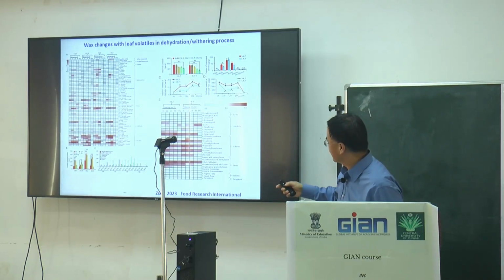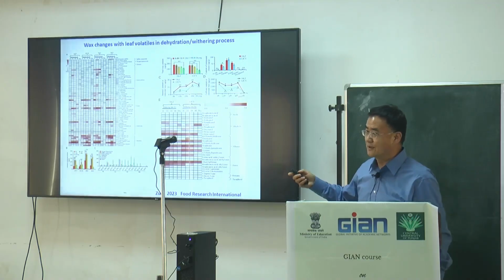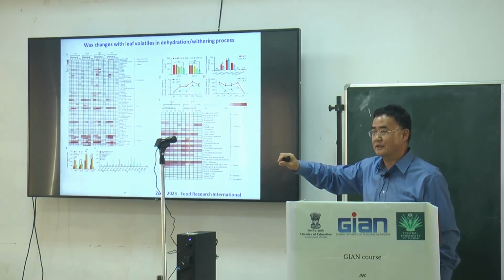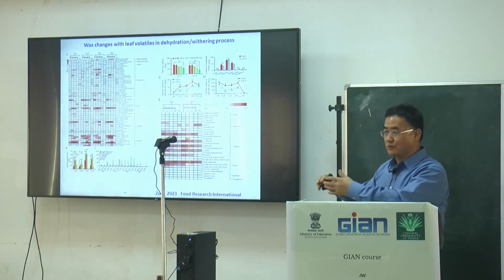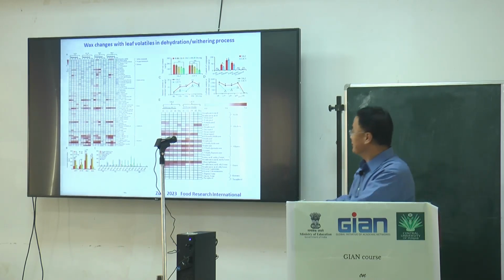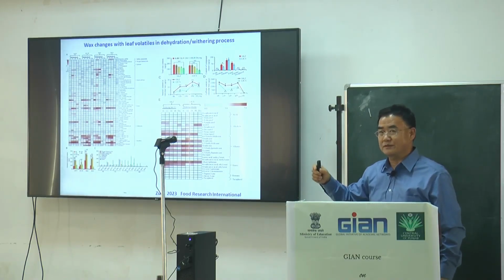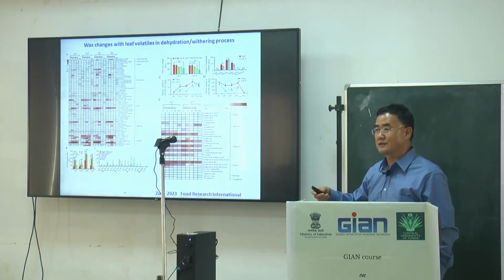This is what we use for tea, the wax analysis. Finally, we connect the possibility that wax loading is thinner or thicker. Those loading amounts could be associated with processed tea flavor. Because some volatiles degraded during processing, the wax degradation generates a different type of molecule than the ones inside the lipid membrane.